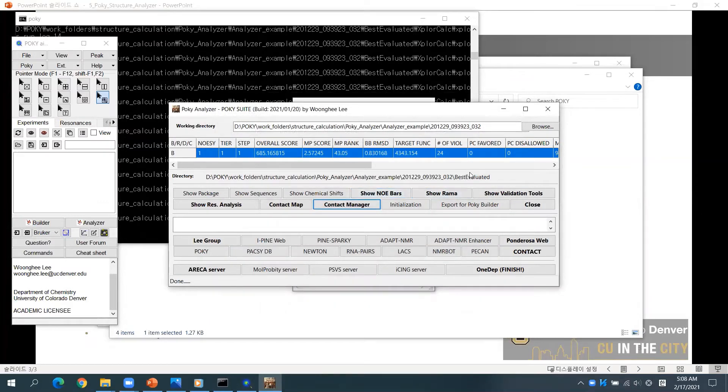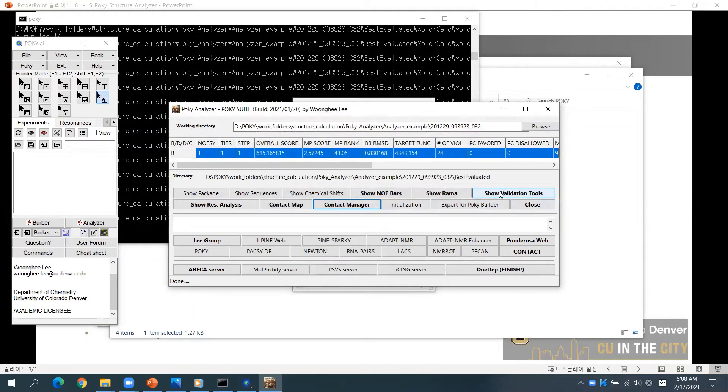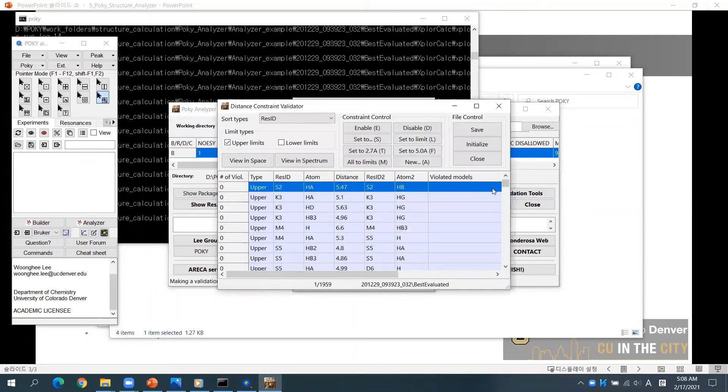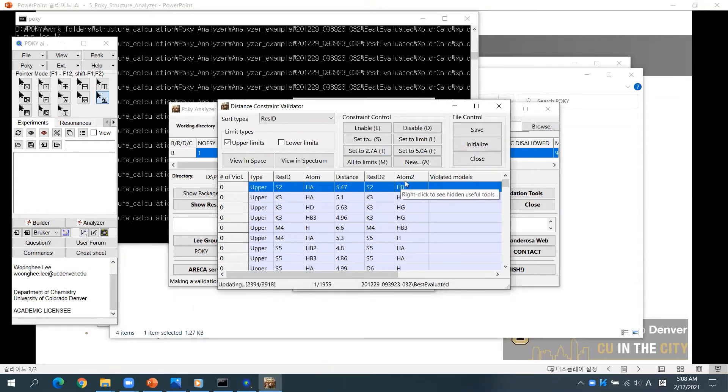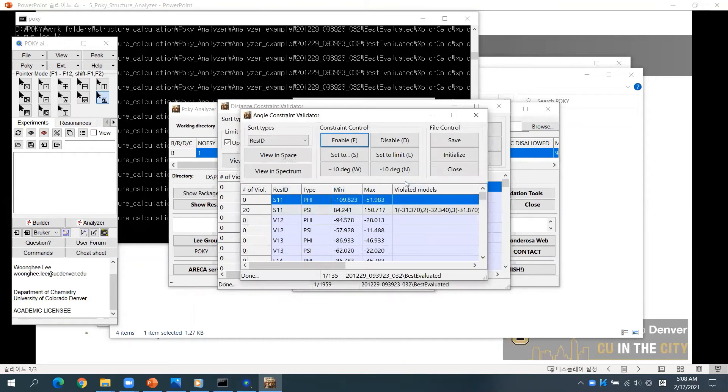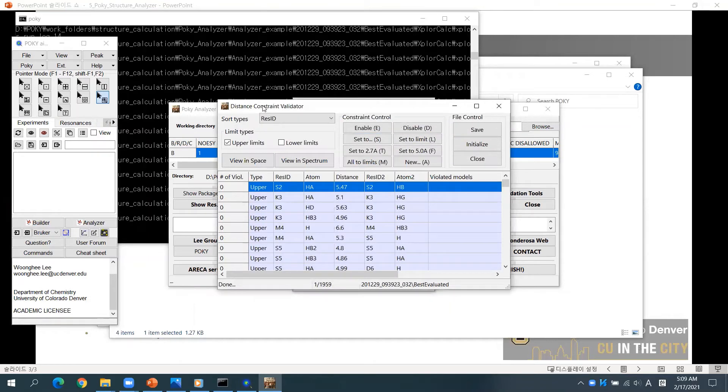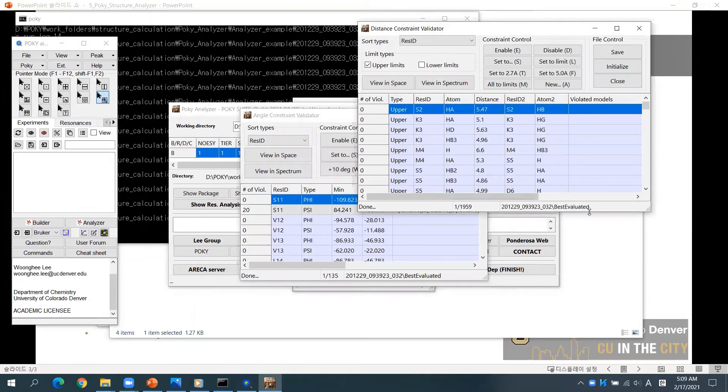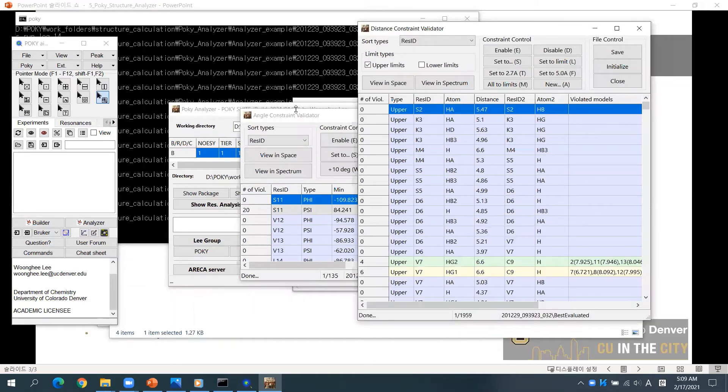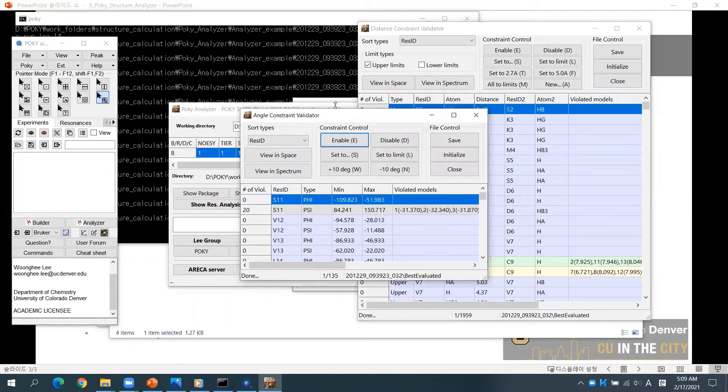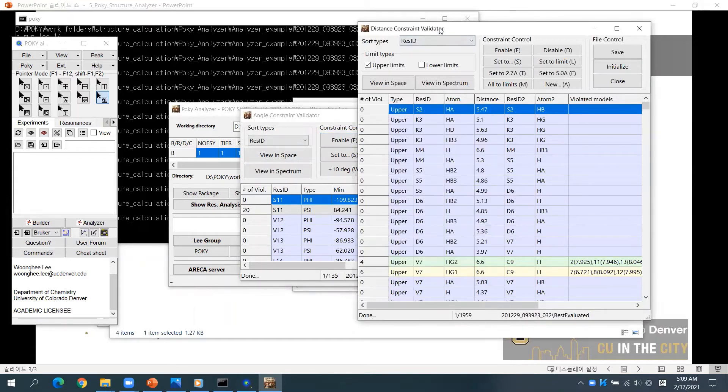Now let's learn how to refine and export restraints. Click Show Validation Tools. You will see two windows for angle and distance validators. For now, I'll focus on the distance validator because the overall workflow of angle validation is almost similar to that of the distance validator.